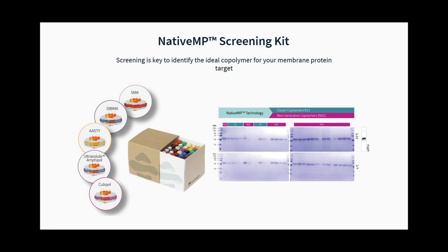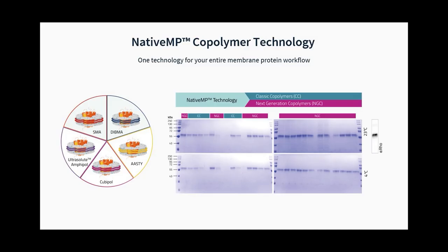We purify, and then of course we check on SDS-PAGE and on a Western blot for the purity of our protein. Is it not degraded? Is it the right size? But we also tap into the powerful capabilities of the Prometheus Panta. You mentioned the Prometheus Panta is a NanoTemper instrument for stability characterization, and so you tap into its capabilities. Can you give us a little more detail about how you use it exactly?